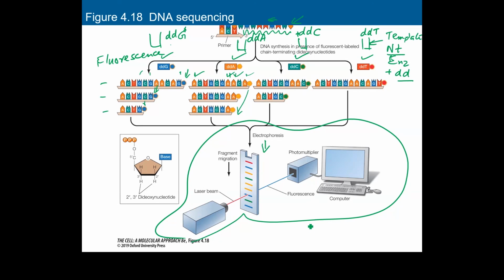That's how most of the human genome was completed. The Human Genome Project was mostly completed by this type of fully automated fluorescent sequencing. This was the second generation of sequencing that we used. It was not really an easy thing to do.